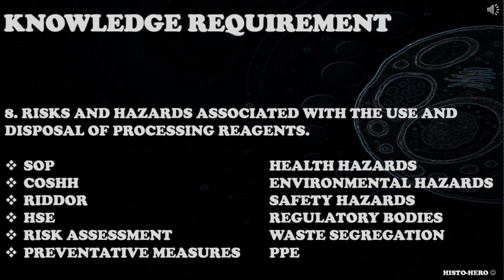When addressing this knowledge requirement, candidates should consider health hazards, safety hazards, environmental hazards associated with processing reagents used, COSHH, SOPs, PPE, regulatory bodies, waste segregation, risk assessments for processing reagents, RIDDOR, HSE, preventative measures, and so on.